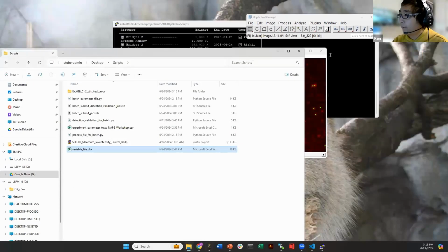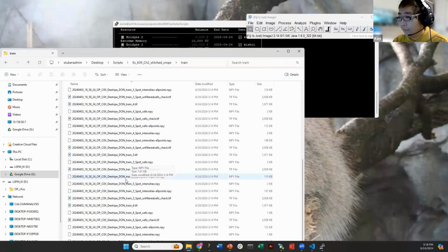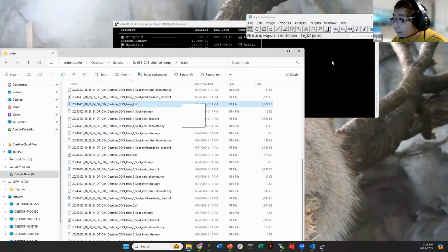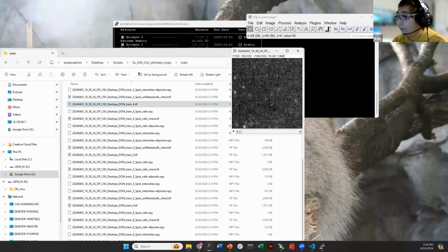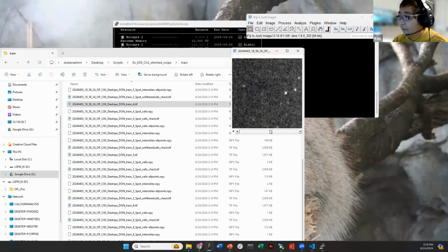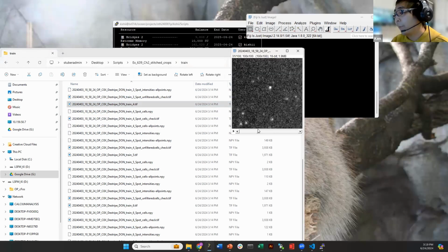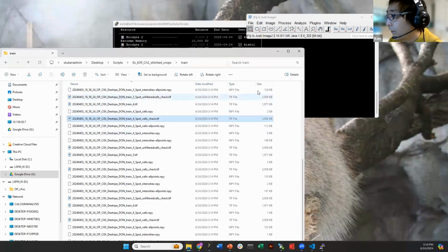So the cropping will not be perfect. You don't necessarily have a lot of good cells in there. But you will have enough. You will get a bunch of crops that should have some good cells in them, and then determine whether the cell detection algorithm worked well by looking into the cells checked file here.